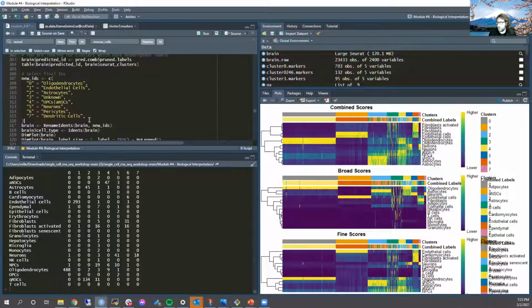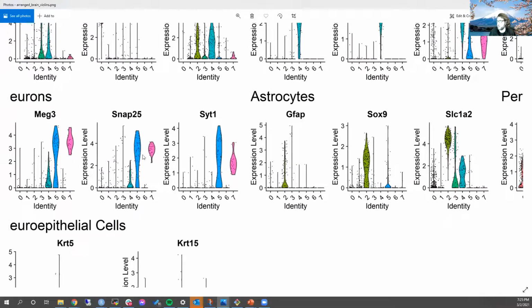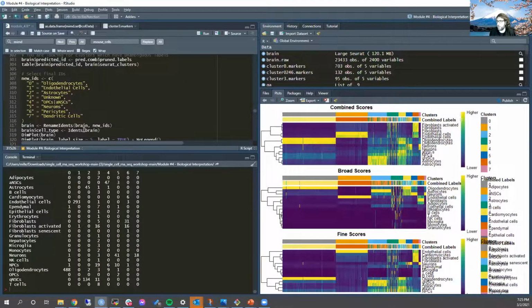All right, finally, cluster 7. So we don't need this cluster 8 here. There's not going to be a cluster 8. Cluster 7, we see neurons. That agrees with our prior knowledge, which showed pretty specific neuronal markers highlighting cluster 7. So I would be pretty comfortable in saying cluster 7 is neurons. It's just interesting that it seems to be a different kind of neuron, or there's something else that's different about this cluster compared to cluster 5, which we also said was probably neurons.